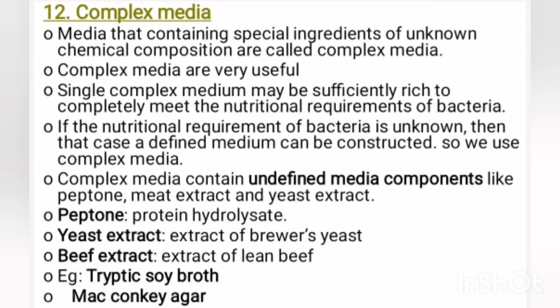Yeast extract is the extract of brewer's yeast. It is an excellent source of vitamin B, nitrogen, carbon, etc. And the beef extract is the extract of lean beef. It contains organic acid, amino acid, peptide, vitamins, minerals. Examples for the complex media are tryptic soya broth, MacConkey agar, etc.